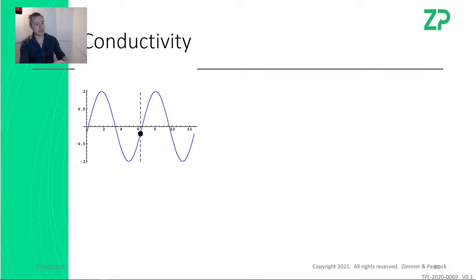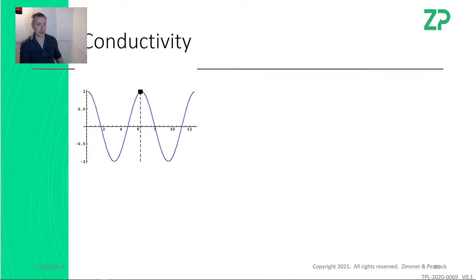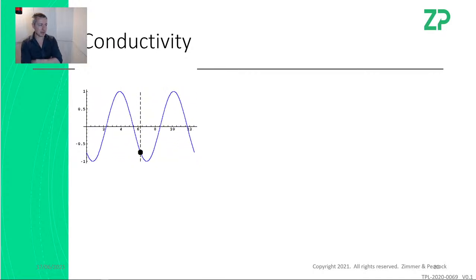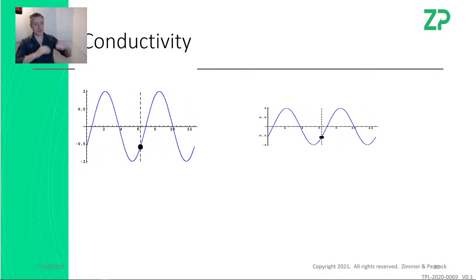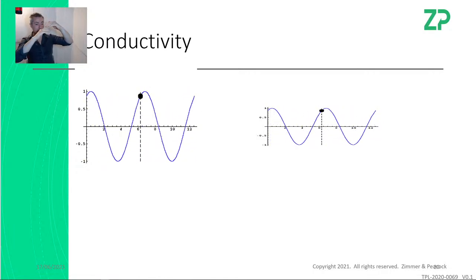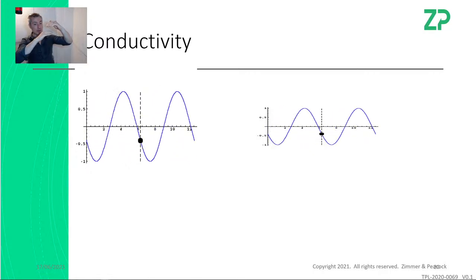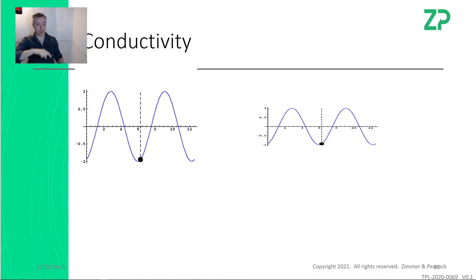With conductivity, the way that we measure it, we apply a sinusoidal wave of approximately 10,000 hertz with approximately plus or minus 10 millivolts. This is from memory. And then we get a current response. Now the amplitude of the current response is essentially proportional to the conductivity of the solution. So big amplitude, low resistance and high conductivity. Small amplitude, high resistance, low conductivity. So we apply the sinusoidal wave.